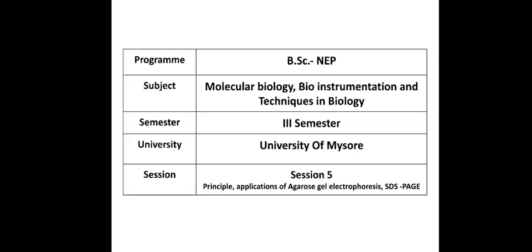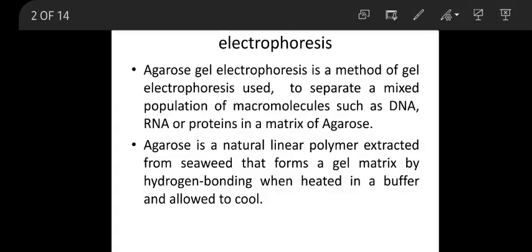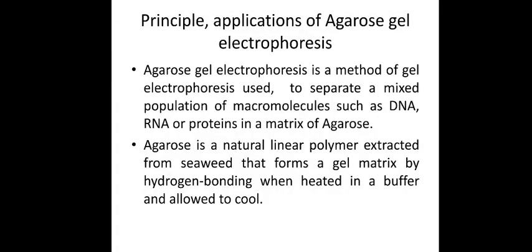In this session, we will be discussing the principal applications of Agarose Gel electrophoresis and SDS PAGE. Agarose Gel electrophoresis is a method of gel electrophoresis used to separate a mixed population of macromolecules such as RNA, DNA or proteins in the matrix of agarose.